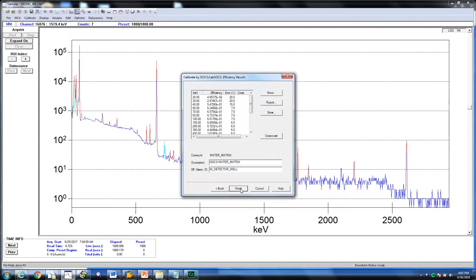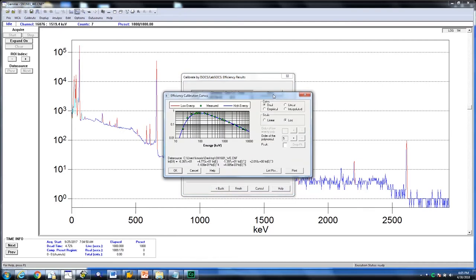Click on show to ensure they have a good fit. We recommend using interpolated curve for a mathematically generated calibration.